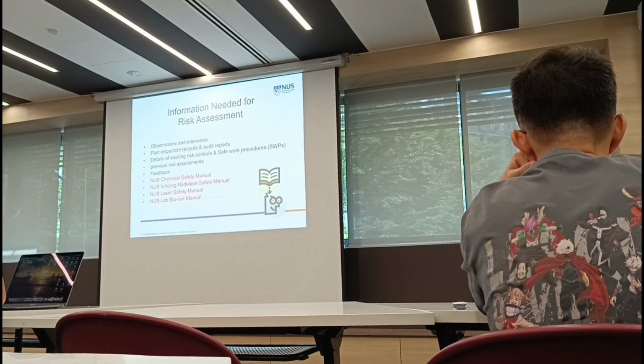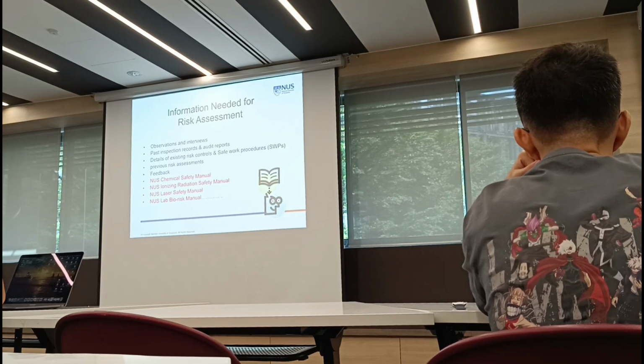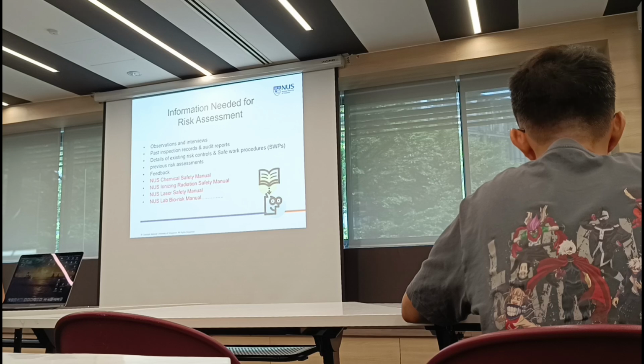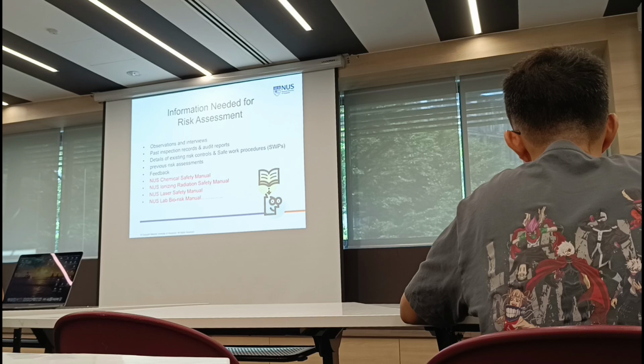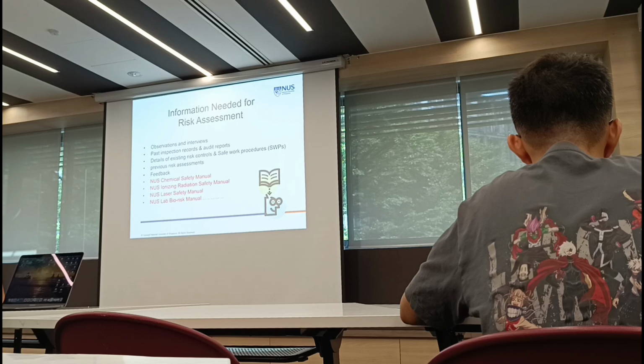But that's not what you need to do. You need to go through it, make sure that all the steps are correct. This is what you're going to do. Sometimes, you know, the supervisor says, oh, this person has used this chemical, why don't you use this particular chemical, right? But then if you copy the same risk assessment, then when the supervisor needs to sign, you will see the old one again highlighted in that particular risk assessment. So then you will know this is just a copy of that, right?